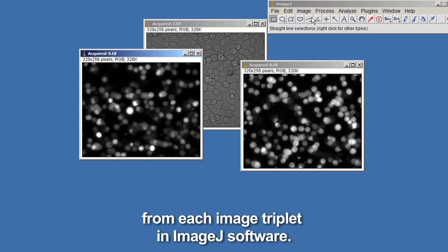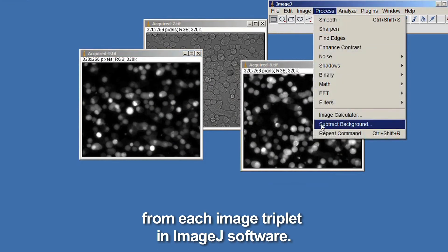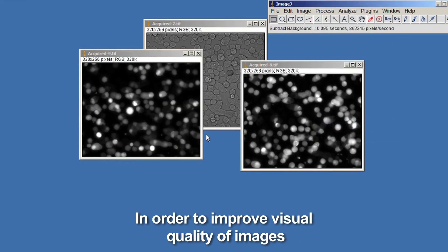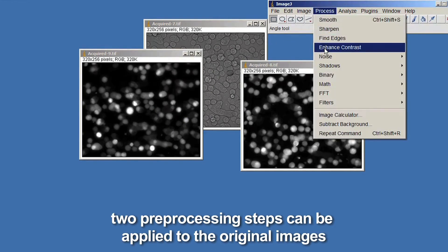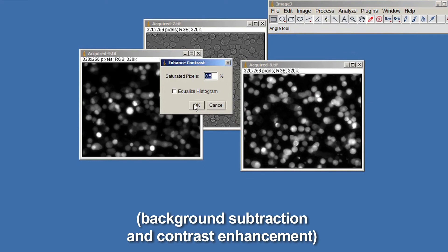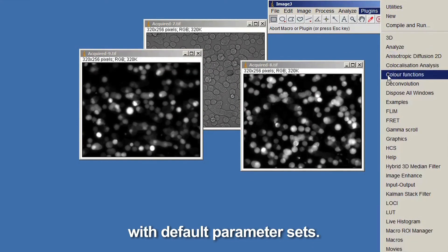Create three-channel images from each image triplet in ImageJ software. In order to improve visual quality of images, two pre-processing steps can be applied to the original images: background subtraction and contrast enhancement, with default parameter sets.